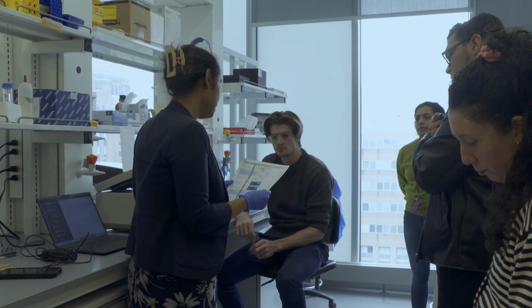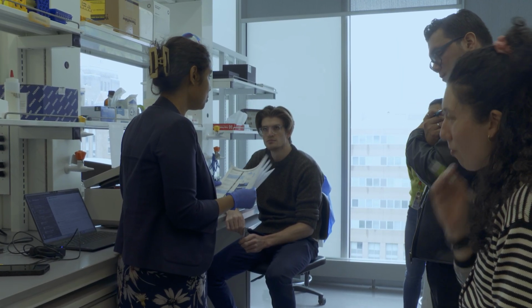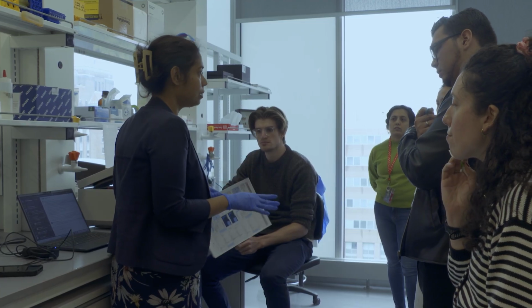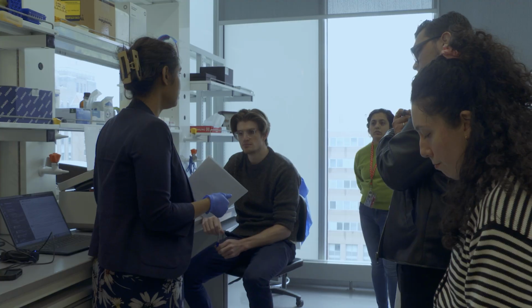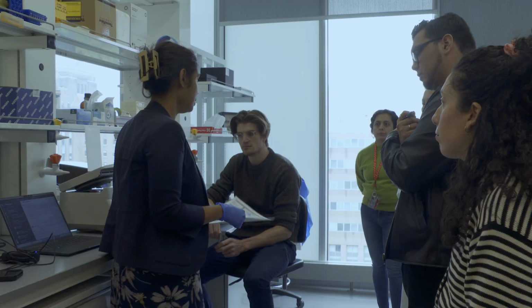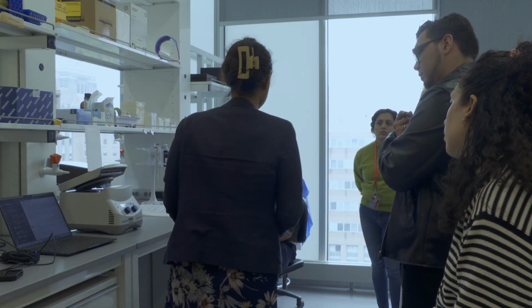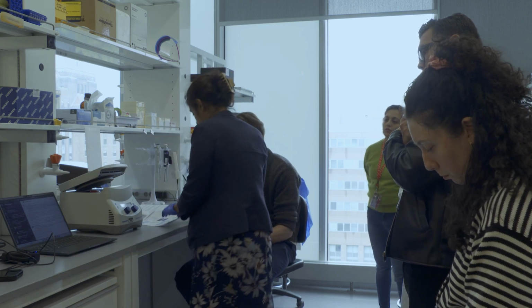Probably that is the most concerning thing, because it will definitely impact the sequencing run in terms of the coverage per sample. Also, pore blocking may happen. We'll see. We'll pick the best from here, and then we can think about how we want to run this experiment.